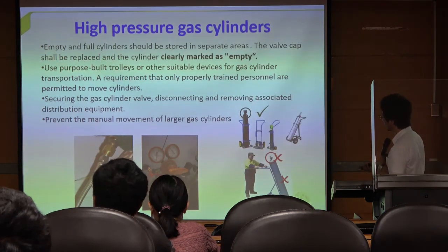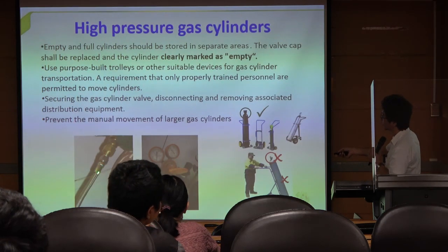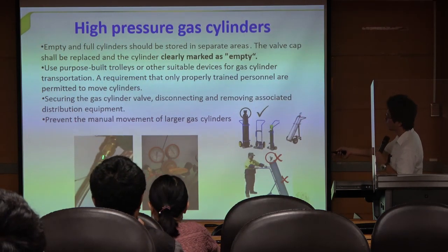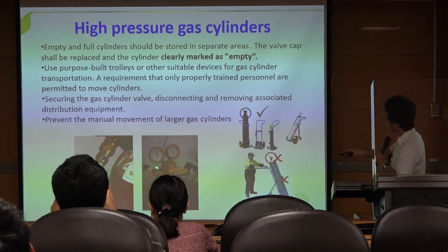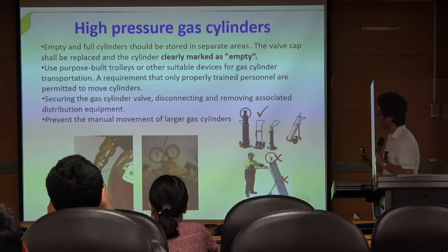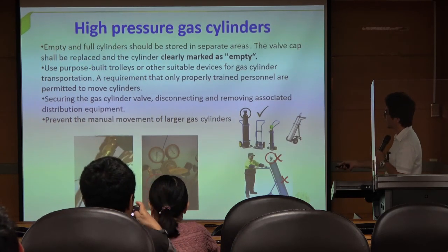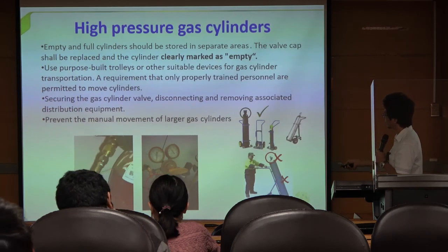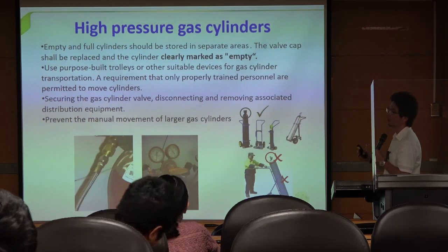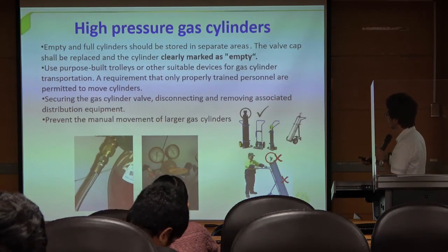So you need to use certified tubes to carry the pressured gas outside the cylinder. Do not use the plastic one. Usually the plastic one is not good compared with the steel one. So do not use the plastic one for high pressure gases.